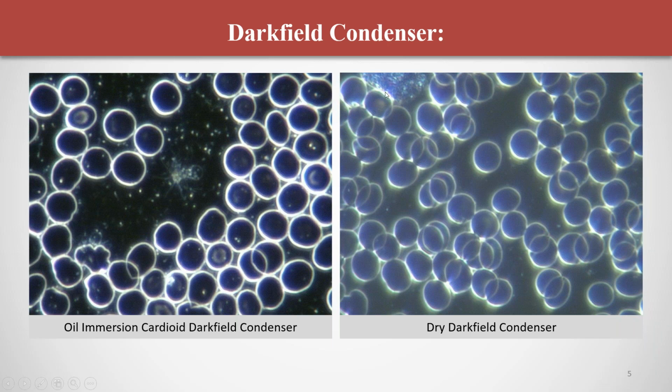And then we also have a most likely a neutrophil at the top here. It's a granulocyte. The most common is, of course, the neutrophil. And they should actually be very bright and highly reflective in Darkfield, but you can see this white blood cell here is actually quite dull and quite gray. So again, you're not really going to be able to assess the white blood cell anomalies properly.